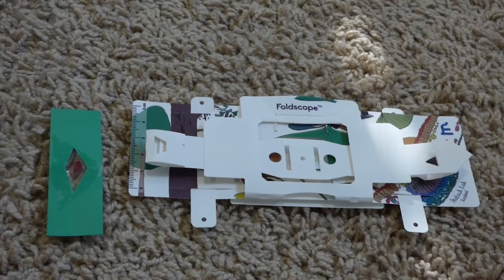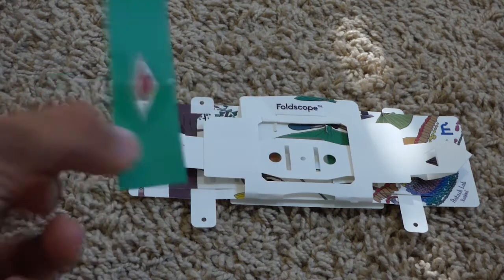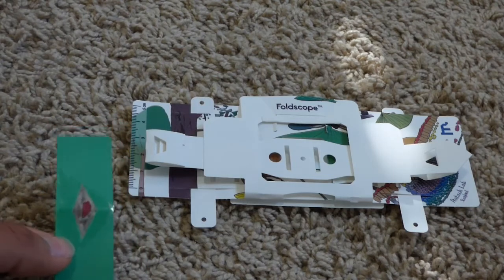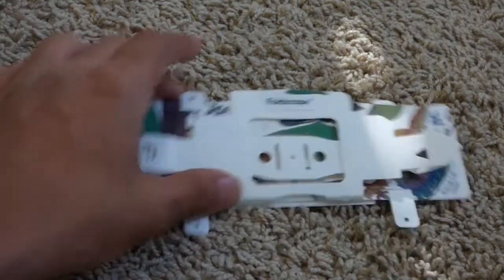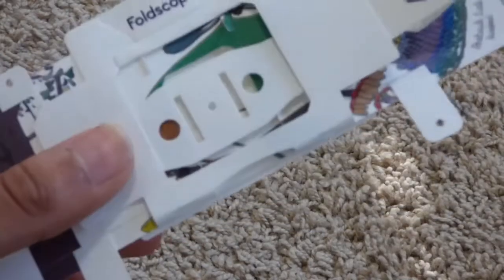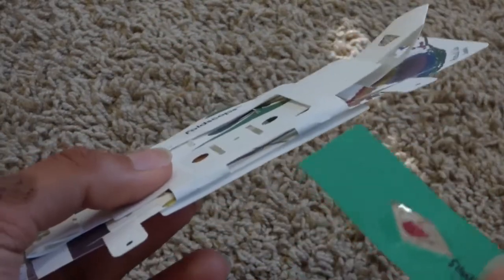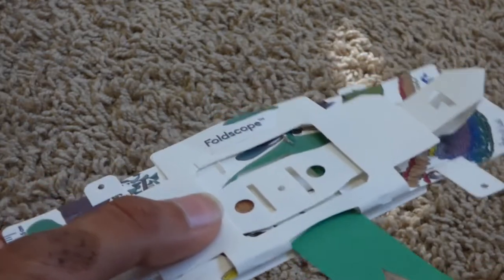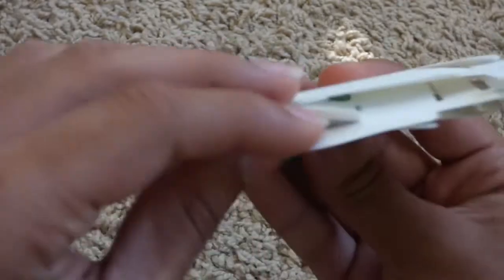Now we're going to take a look at how we can put our paper slide that we created in the last video inside one of the older versions of the Foldscope. All we have to do is take the Foldscope and locate these two edges right here and right here — this is where we're going to put our slide. Next, locate the bottom edge and place and push your slide through. Make sure it passes underneath the lens area and then push it through the other side where you can see the slit.